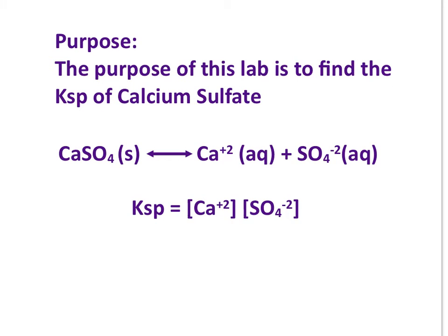This video is a little bit of an introduction to the lab that you will be performing, where you will be determining the Ksp of calcium sulfate. The purpose of this lab is to actually find the value of calcium sulfate's Ksp. You can see here that this is the reaction that you will be putting in your ICE table ultimately to figure out that Ksp value.